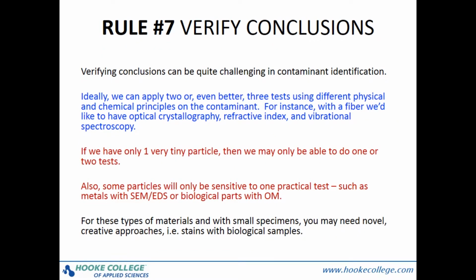Rule number 7, verify conclusions. Verifying your conclusions to me is just simply good scientific practice. In my opinion, the best result for the contaminant analysis comes from having 3 sets of data in agreement that come from 3 different physical principles. For some samples, of course, that's just not really very practical.